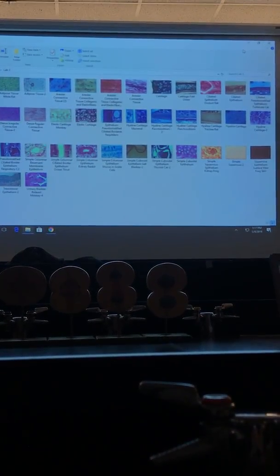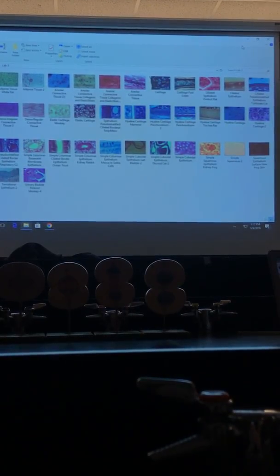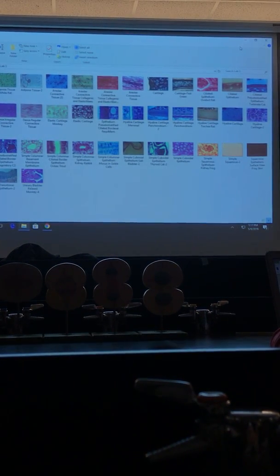So that was slide 6, 7, adipose, yeah, then 8, 9, 10, 11. So that's it for now.